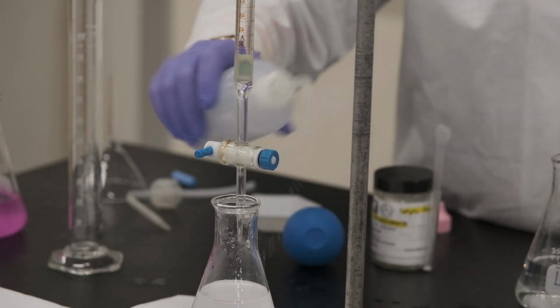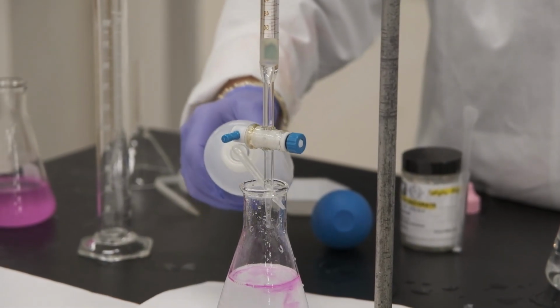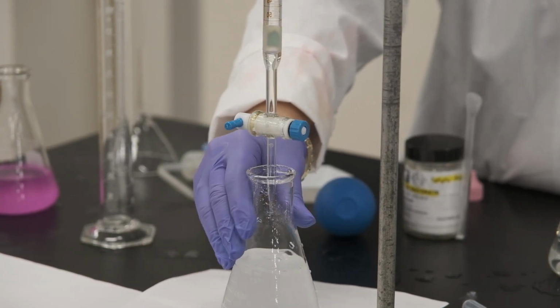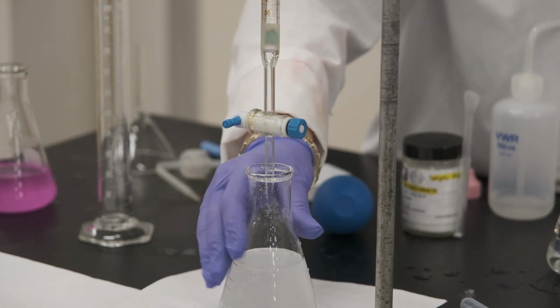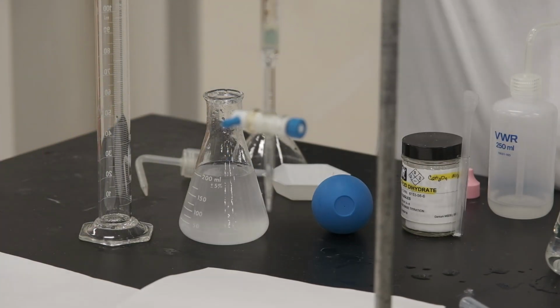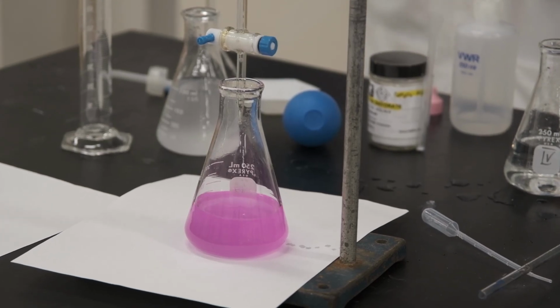Every time I'm titrating, you see that when the sodium hydroxide is added, some falls on the walls of my solution. So I constantly clean the walls with deionized water, because we know that the moles of oxalic acid that we added are always the same, okay? So I perform the titration until my solution becomes pink. Now, when the solution becomes pink, I reach the end point of my titration.